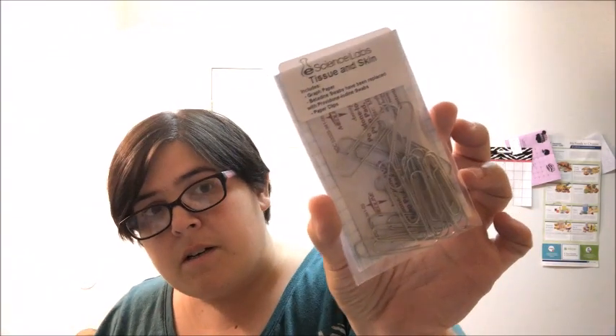I believe we are dissecting two things in this level of the course — a sheep's brain and a cow eye, or something like that. They sent one Medline mask, but I can get masks from work and from dialysis supplies. Then we have this little packet labeled 'Tissue and Skin' — it says it includes graph paper, betadine swabs replaced with povidone iodine swabs.